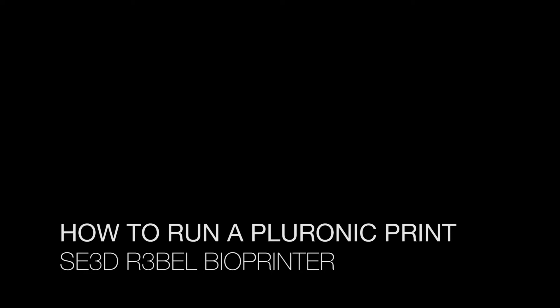In this video we will cover how to run a Pluronic print on your Rebel Bioprinter. Pluronic is a thermosensitive material, which means that when it's chilled it's liquid, and at room temperature it's gel-like.